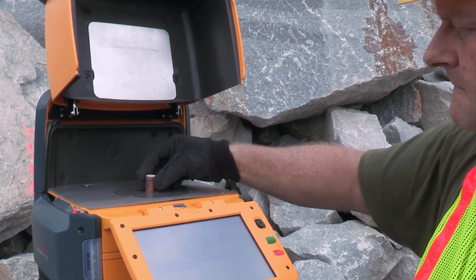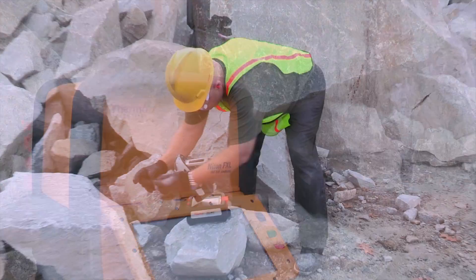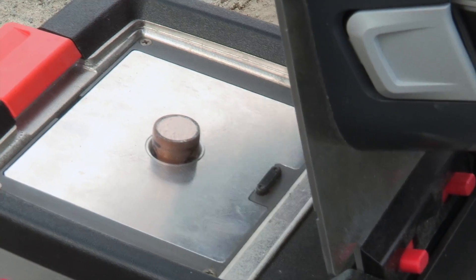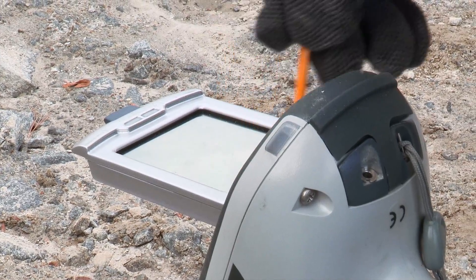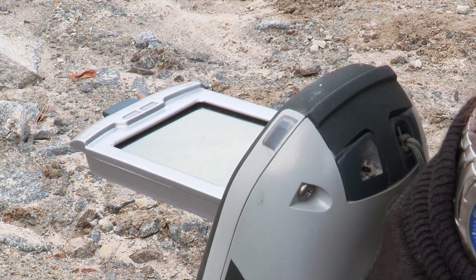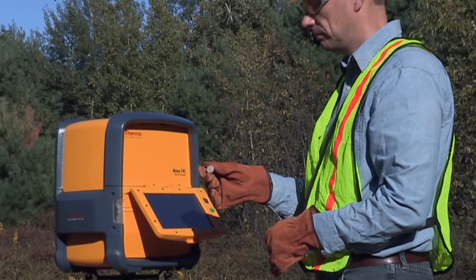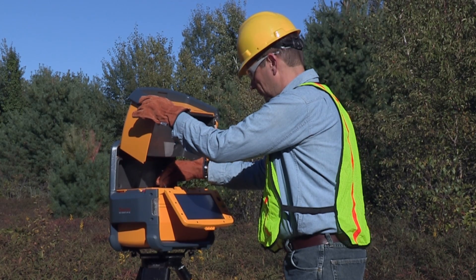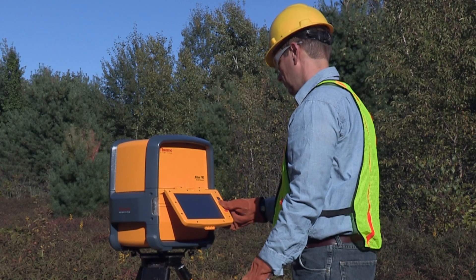Now you are ready to analyze the pellet. Place the pellet directly on the Niton FXL or in the Thermo Scientific Fieldmate test stand and, with the analyzer installed, close the lid. You can now enter the name of the sample on the touch screen of the analyzer for later identification, then click the trigger to begin your analysis. We hope this video has been helpful in explaining how to achieve higher accuracy data from your geological samples using Thermo Scientific mining sample collection and preparation tools along with Thermo Scientific portable XRF analyzers.